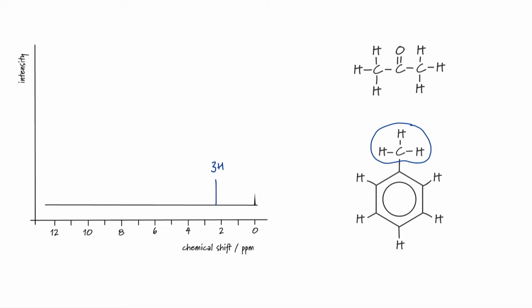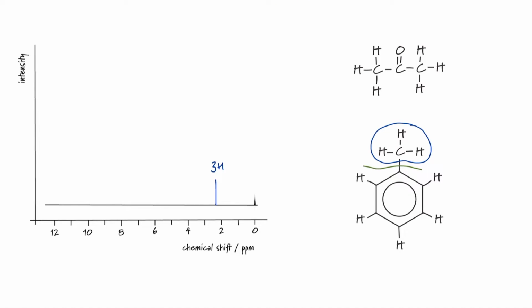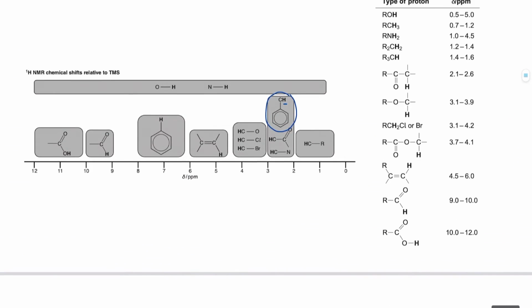3 protons on that. And keeping things simple, we are going to treat the 5 protons that are directly bonded to carbon atoms that are part of the benzene ring as equivalent. So again, looking back, I'm looking for protons at a higher chemical shift, round about, what does that look like?